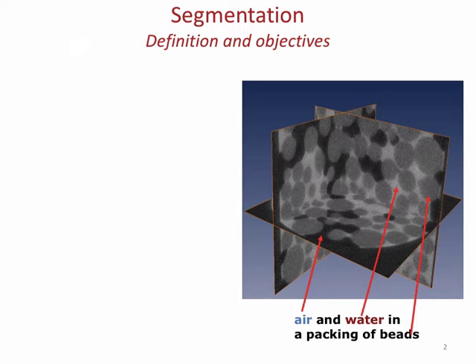So my porosity average will actually calculate correctly. But that doesn't mean that I have a quality image that I can work with, especially if I want to do simulation. So just evaluating porosity and finding a satisfactory number means nothing in terms of evaluating your segmentation.